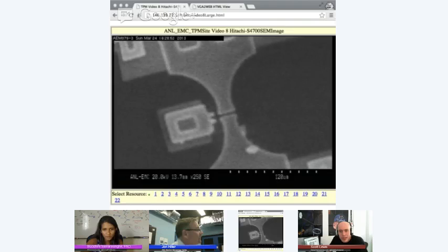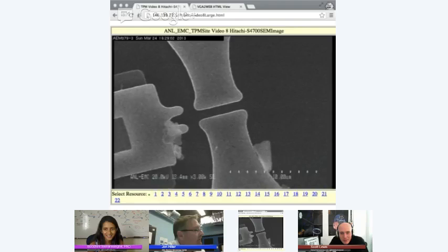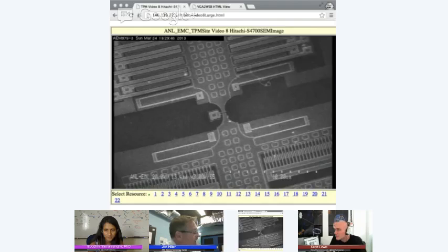Wow. That is awesome. Across that bridge is where you would put your sample. Now, I'm going to refresh. Okay, my length scale, my micron marker is not right. The width of that bridge from left to right is about 8 microns. Wow. I think it just refreshed over here so that everybody can see it. So if we can get our sample across this micro bridge and apply a voltage, we can then watch and see when our sample will fracture.